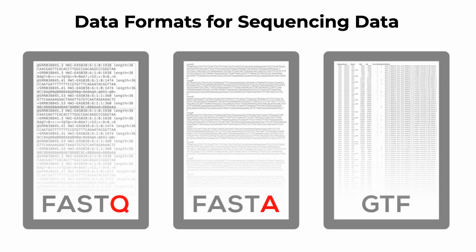Okay, so it has the quality score, FASTQ short reads and FASTA reference sequences. FASTQ is for small sequences.